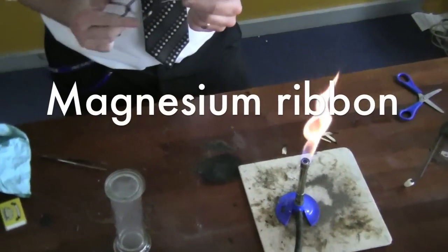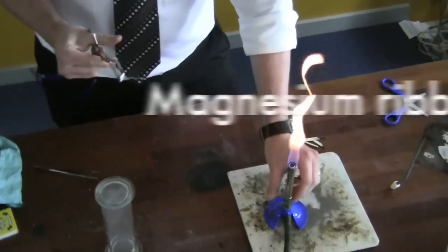Magnesium. Piece of magnesium ribbon. Tongs. And again, you're going to need a roaring flame.